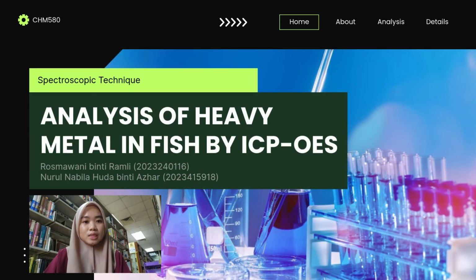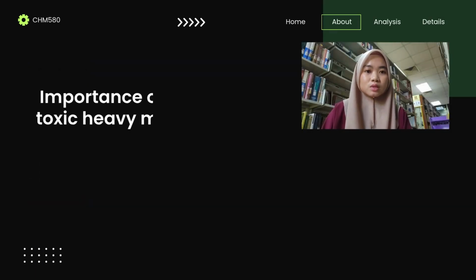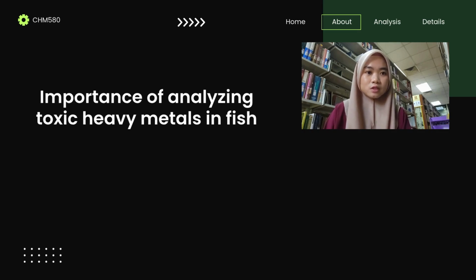In this video, we will discuss a spectroscopic technique of our choice, which is inductively coupled plasma optical emission spectrometry (ICP-OES), that is used to analyze toxic heavy metals in fish. Firstly, let's see why it is important to analyze toxic heavy metals in fish.